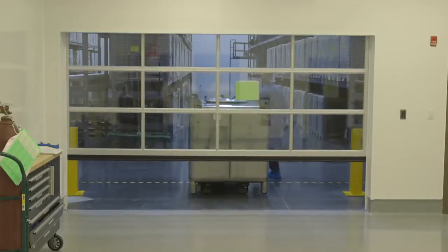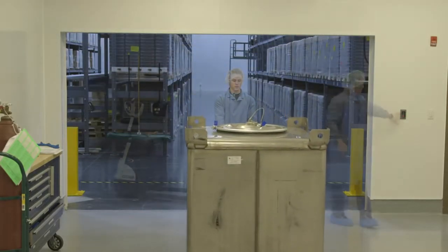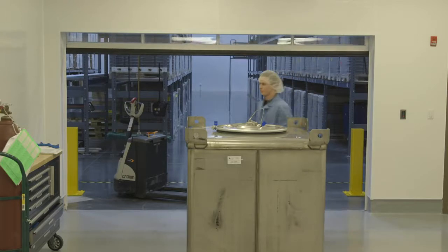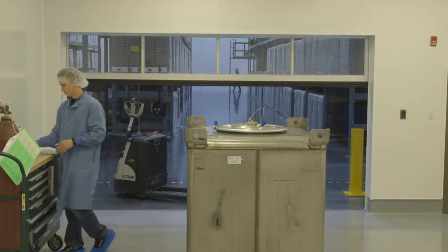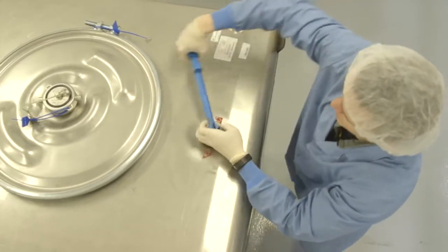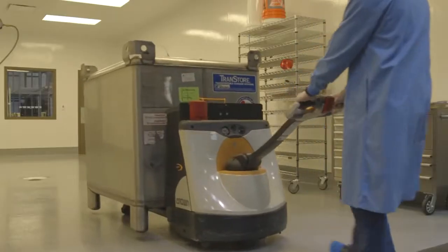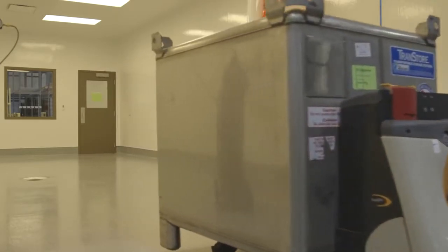Most of the things that we do here are in an effort to ensure the quality. We have a very strong standard of quality and we want to make sure that we meet that. The minute the oil arrives, within 24 hours we will take that oil into a sampling room and we will pull samples out of that, and we do various tests to check that oil and its chemical makeup against the specification that doTERRA has set to our suppliers.